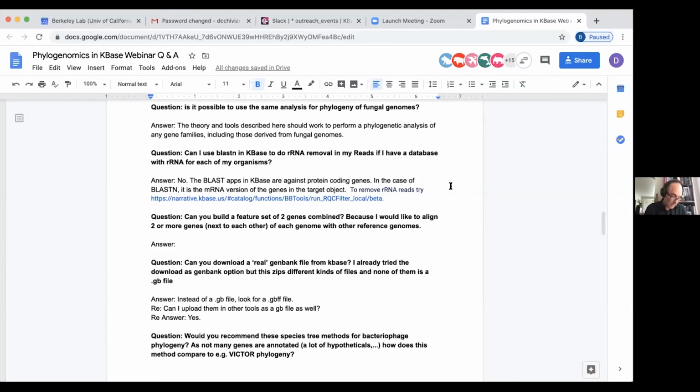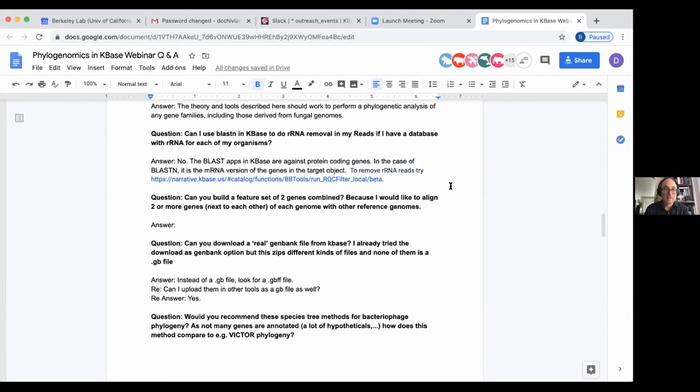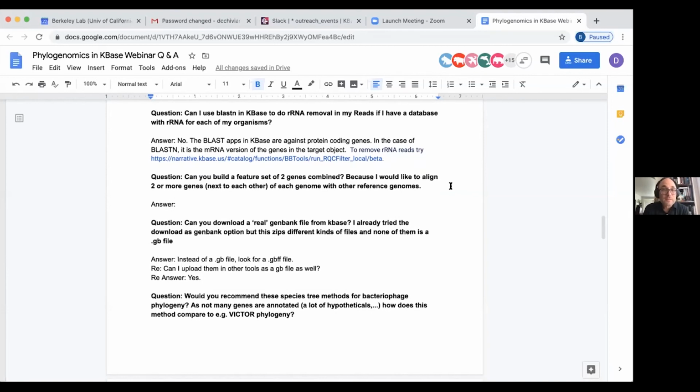Obviously, fungi are very important, and we're trying to expand based on whatever knowledge is extant and bring that into KBase. But please work on fungi and viruses and expand our knowledge there, as for all of us.